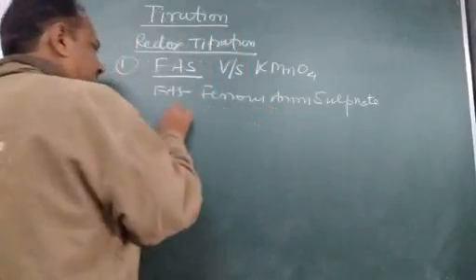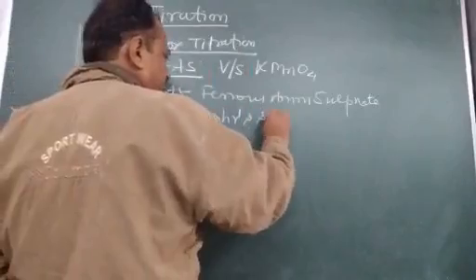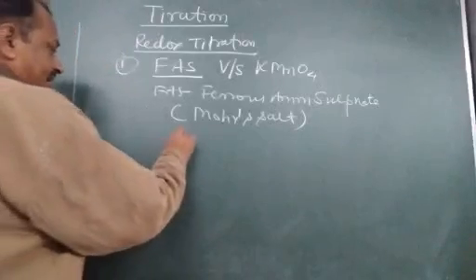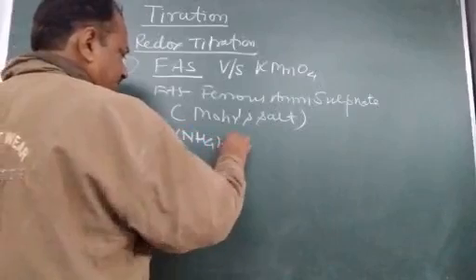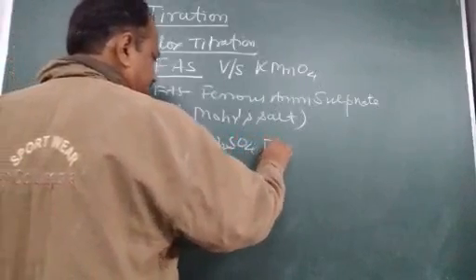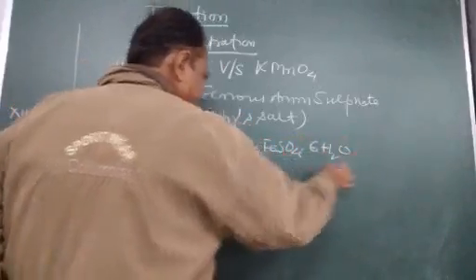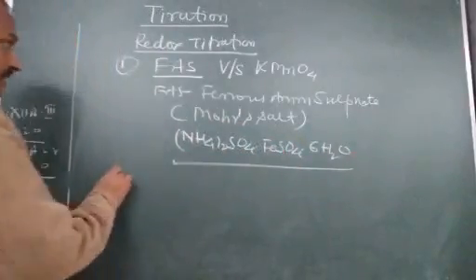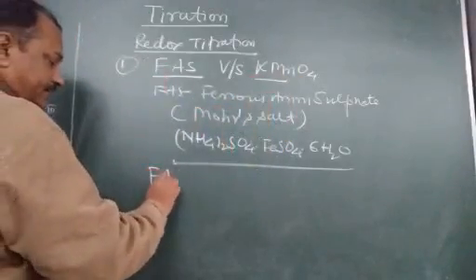Ferrous ammonium sulfate, commonly it is called Mohr's salt.